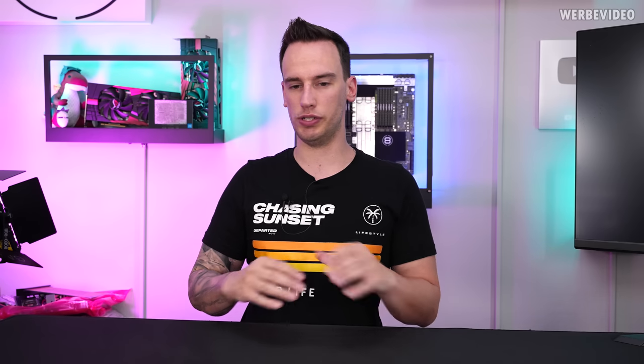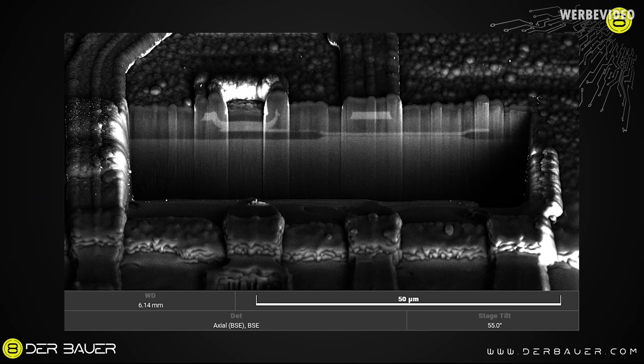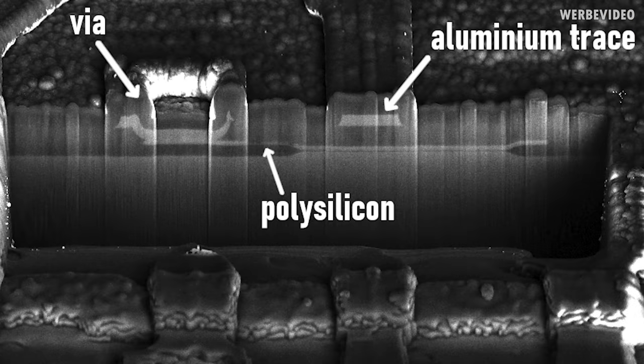We decided to have more areas where we cut with the focused ion beam to get more cross-sections. In this image, you will recognize some parts again, such as the trace made out of aluminum in the center and the via on the left. What is interesting here is that the trace and the via are forming a connection to polysilicon. By knowing which material we're looking at, we can estimate what part of the CPU or transistor we're looking at. For the Intel 4004, the traces are made out of aluminum and the gate — the switching part of the transistor — is made out of polysilicon.